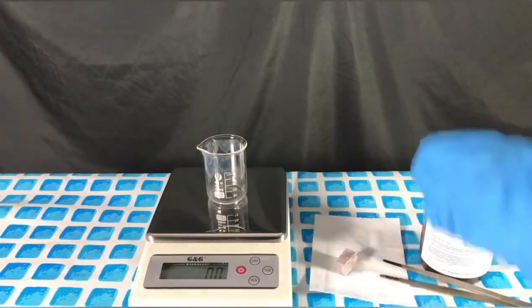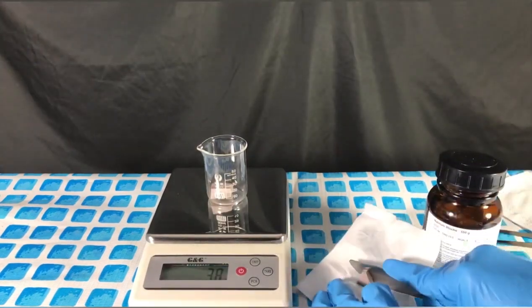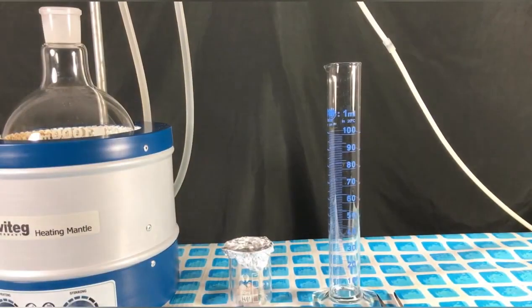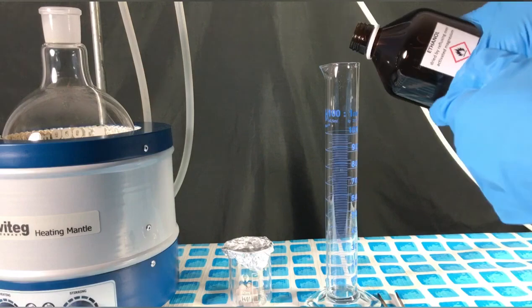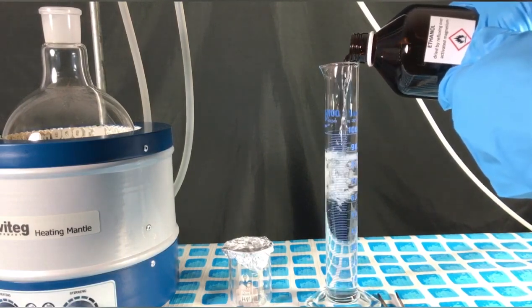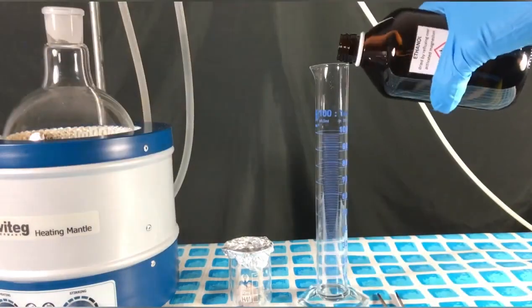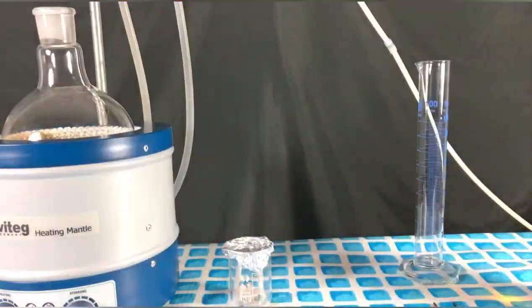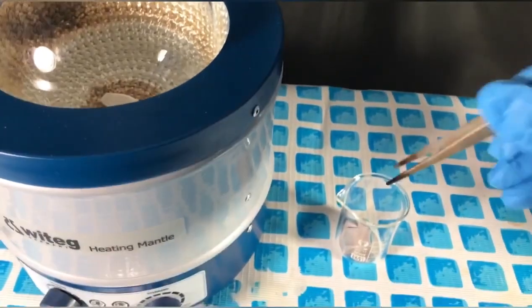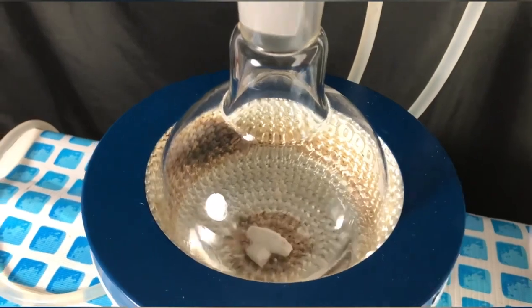We then start off by weighing out the 5.8 grams of sodium metal. The sodium metal was wiped dry to remove any paraffin that stuck to its surface. Afterwards, 125 milliliters of dry ethanol were measured out and added to a 1 liter round bottom flask. A stir bar was placed into the round bottom flask. Afterwards, all of the metallic sodium chunks were directly thrown into the dry ethanol.